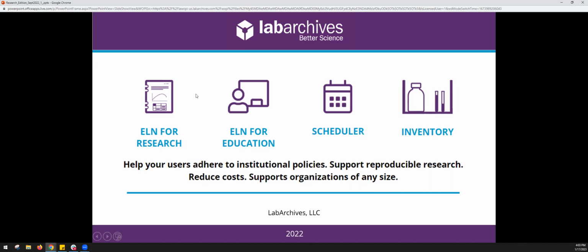So we're going to be focusing on the ELN today, where ELN stands for Electronic Lab Notebook. Sometimes people call it Electronic Research Notebook or even Digital Research Notebook. All of our tools are designed to help you and your researchers, your colleagues, your collaborators adhere to institution policy, but also government funding agency policy. We've been doing a lot of work with NIH 2023, but other similar policies are in place to help researchers meet those needs, but really scale with a group.